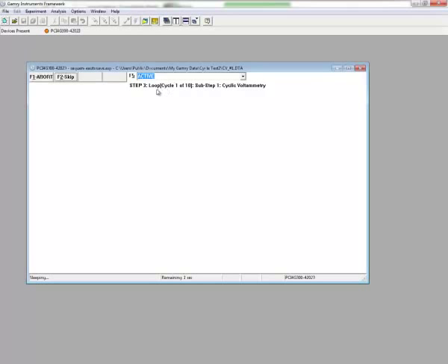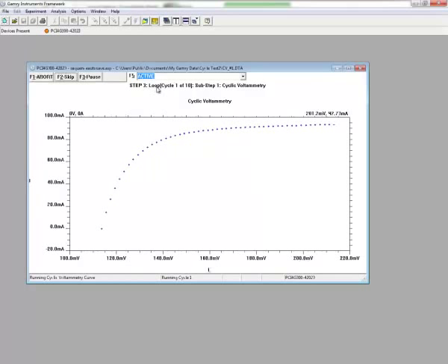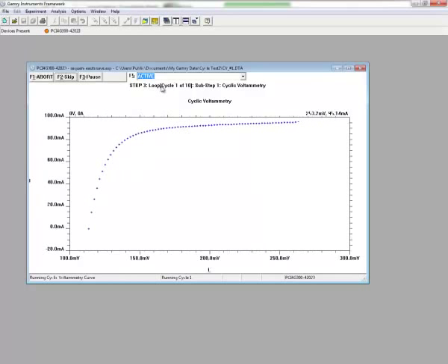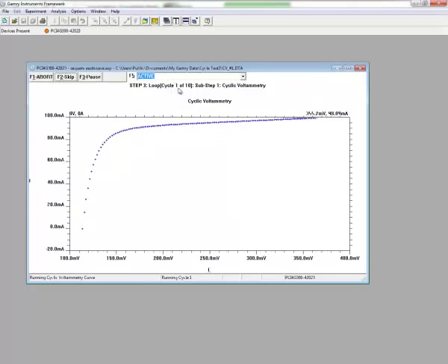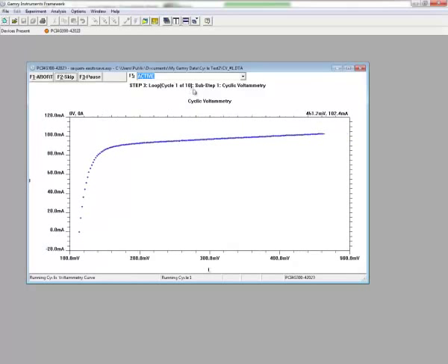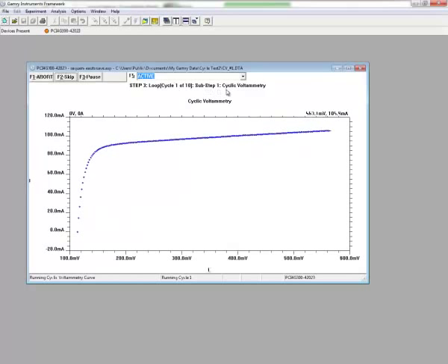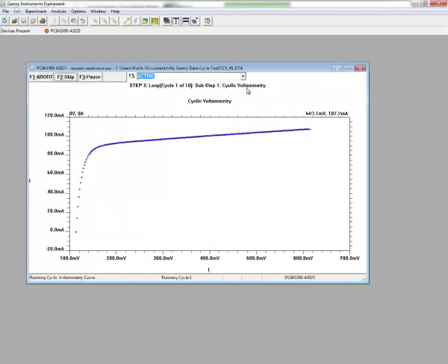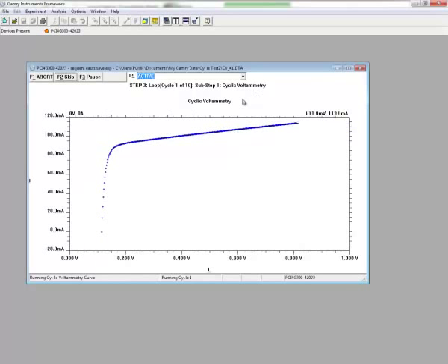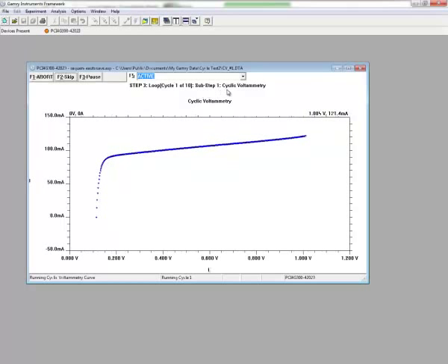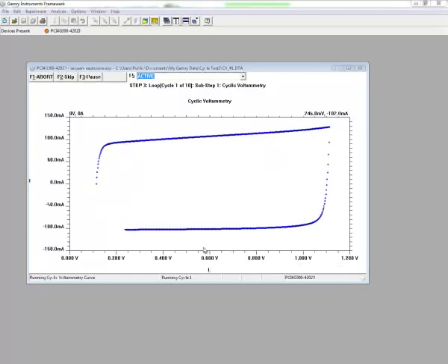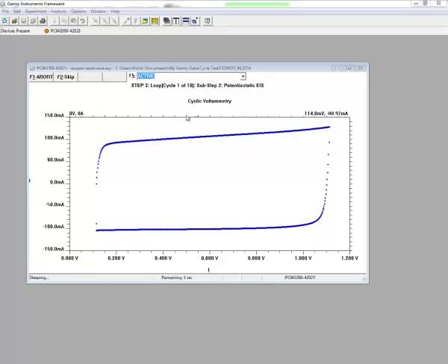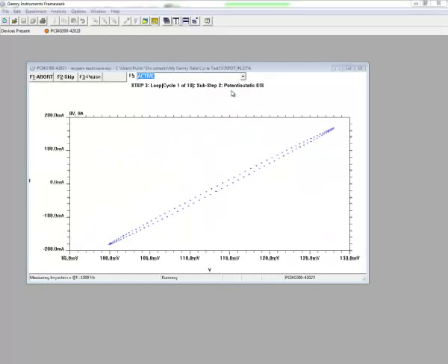Now we can see the setup window that we're looping based on a cycle. We're in the first cycle of 10, and the first step in that cycle is cyclic voltammetry. Once this experiment finishes, then it's going to move on to sub-step 2, which would be the potentiostatic EIS that we saw earlier. And so we can see that the cyclical voltammogram is just about finished, and we're going to move on to step 2, which is potentiostatic EIS.